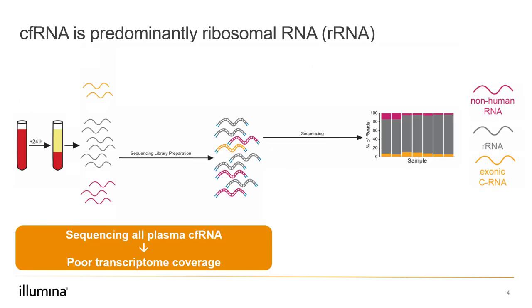Next, we wanted to identify a sample preparation workflow that would maximize the amount of transcriptome data we could get out of cfRNA. As it turns out, if you generate a library from all the cell-free RNA molecules in plasma, you wind up sequencing almost entirely ribosomal RNA — shown as gray bars in the graph — and that's not particularly interesting or informative.